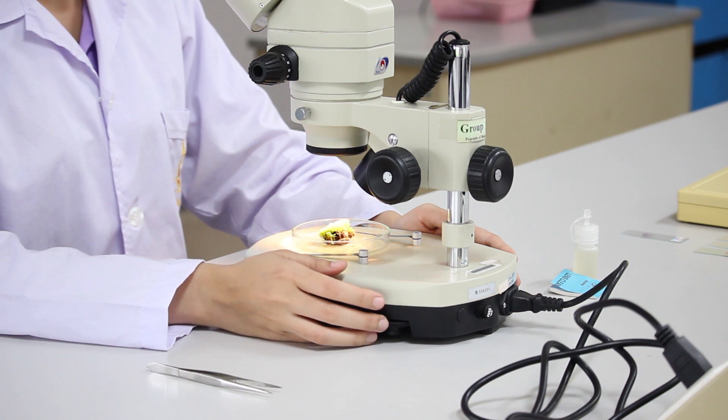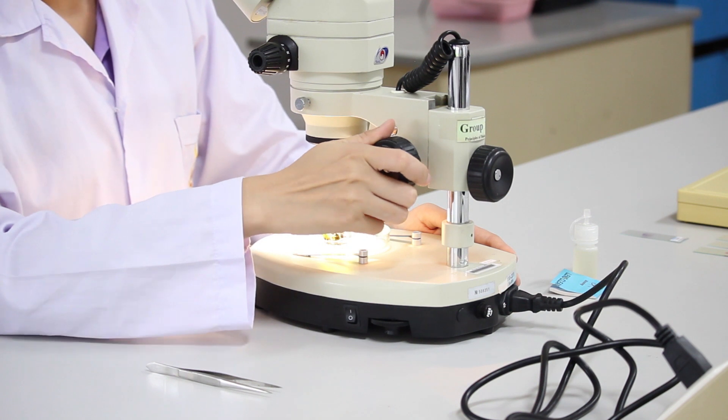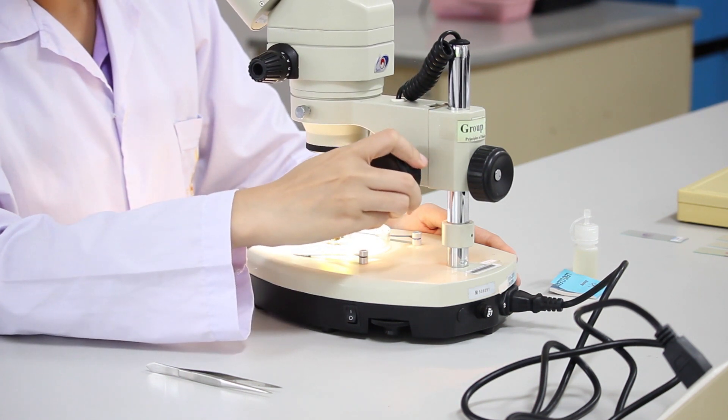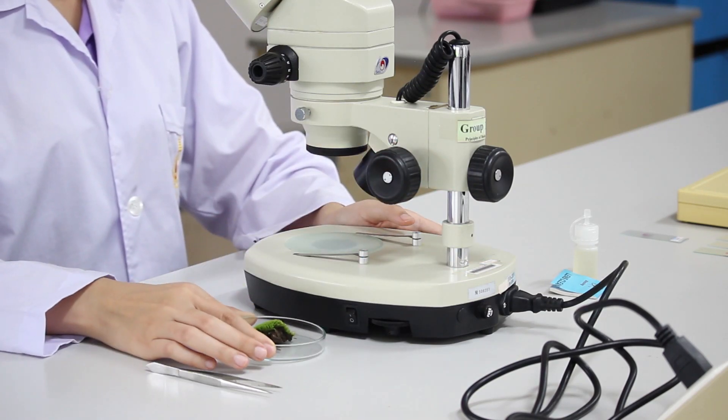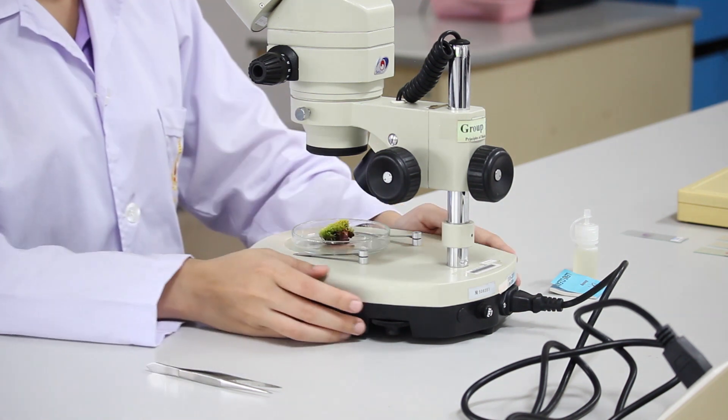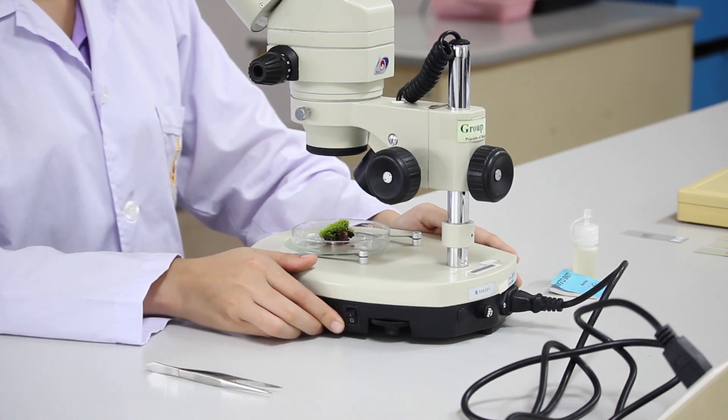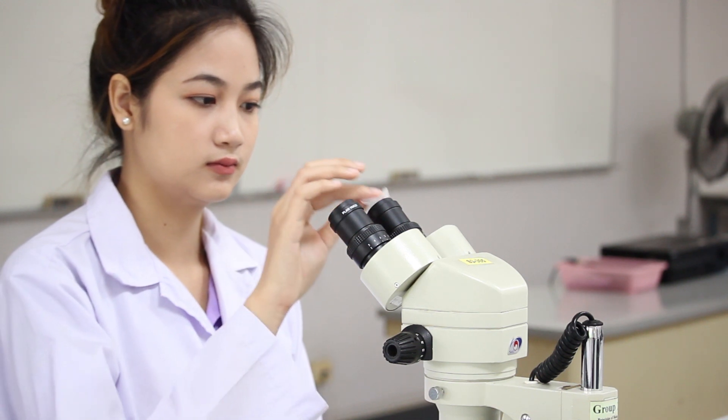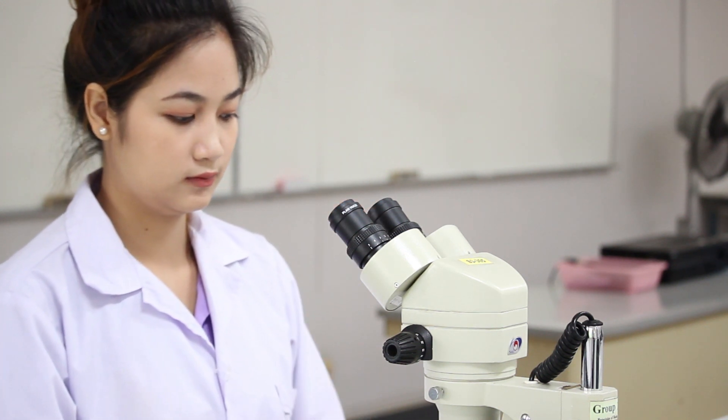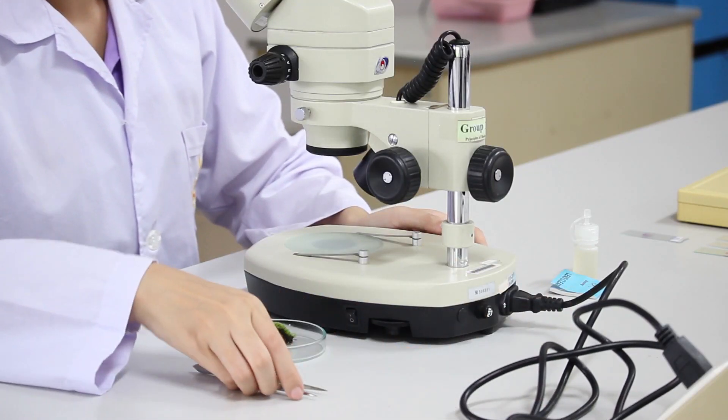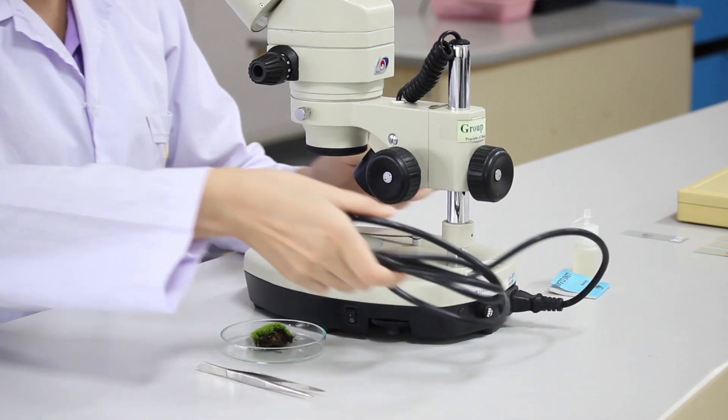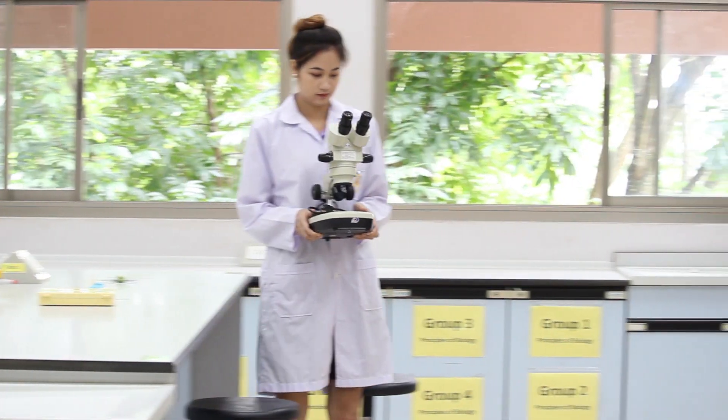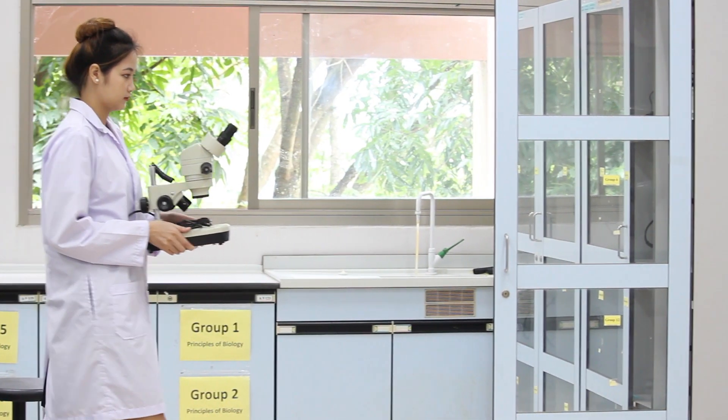After that, when you finish the observation, reduce the light intensity and then move the objective lens into an appropriate position. Then, take the specimen out from the stage and turn off the light sources. Clean the objective lens and eyepieces with lens paper. And then, unplug and place the power cord on the microscope stage. Then, return your microscope back to its cabinet and put it in the right place.